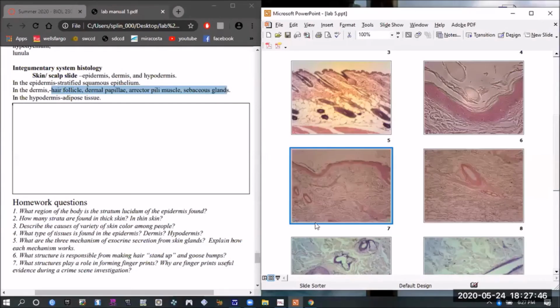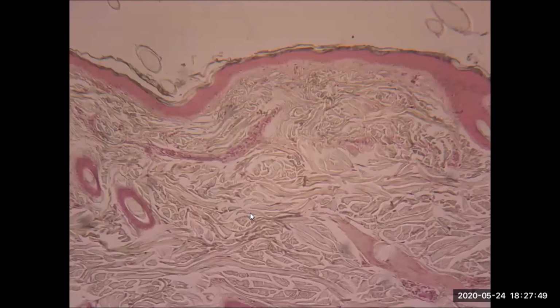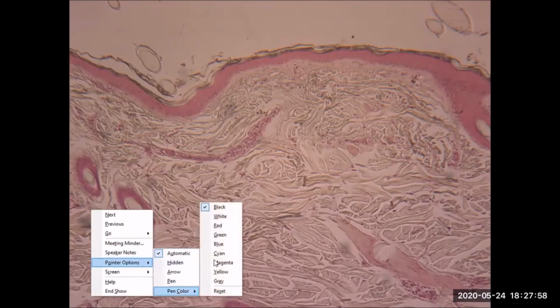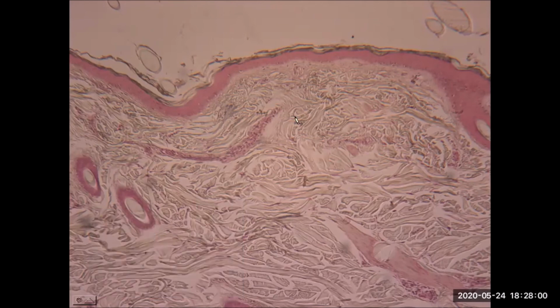All right, so here we are in the area of the dermis, and we'll scroll through a couple of different slides to see these features. So we have the dermal layer, of course, and here we see a couple examples of some hair follicles, just a small segment. You'd have to imagine this follicle is running at an angle, coming, say, out of the screen. So we just see that small segment of the hair follicle with some of the hair roots still within.